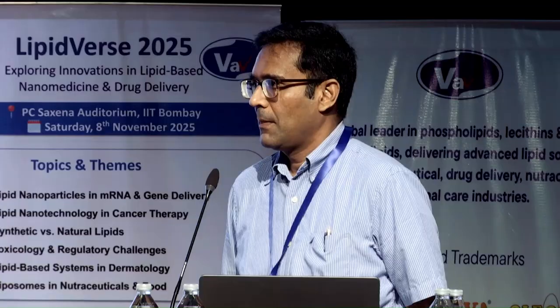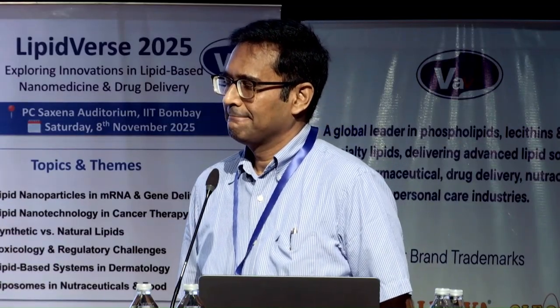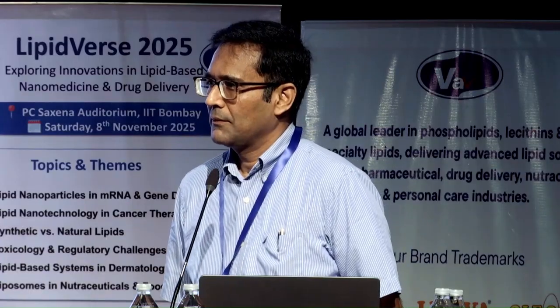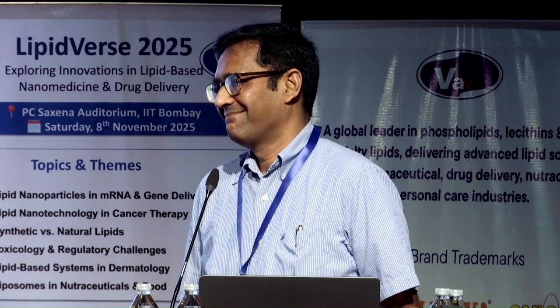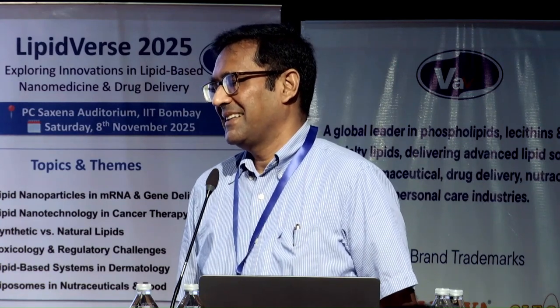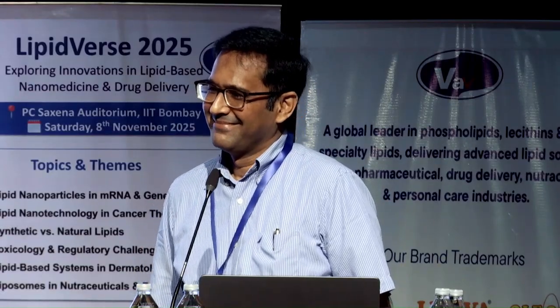Yeah, so that was a really interesting and simple approach, very promising. I had just one concern about the use of alumina, which you may need to look at if you're looking at scaling, whether that could contaminate the liposomes, even in nano quantities. That is something you need to keep in mind as you take this forward.